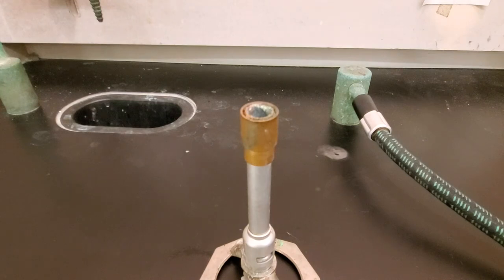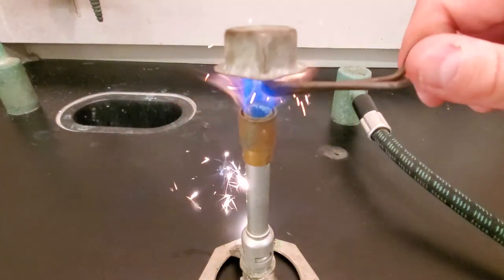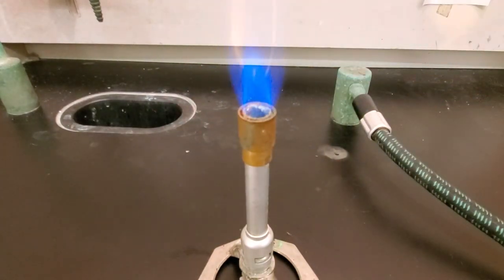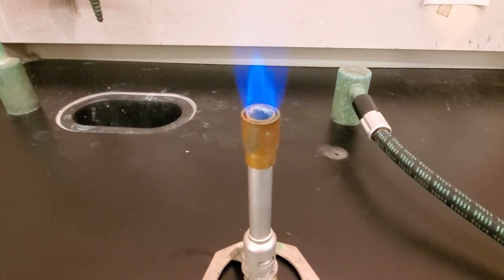Pretty easy test to do. We need our burner, so let me go ahead and light this. We generally want a fairly hot flame for this, and you can see we've got a nice hot flame.